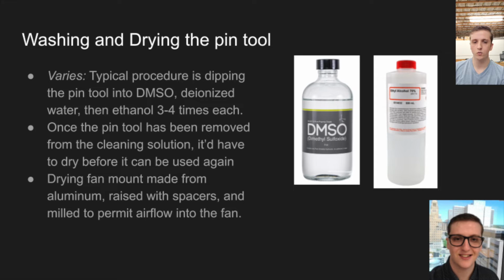We have 3 different wash reservoirs on our robot, and we have a drying fan that is mounted to a milled aluminum plate which is raised above the base of the robot so that it allows for airflow into the drying fan, and that works great.